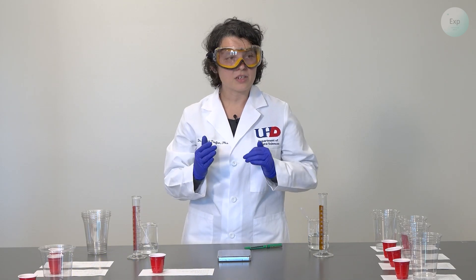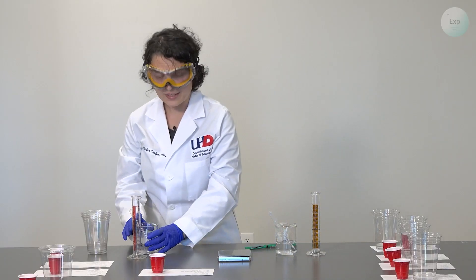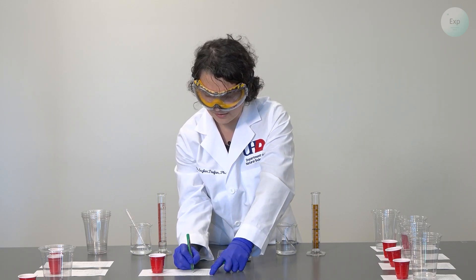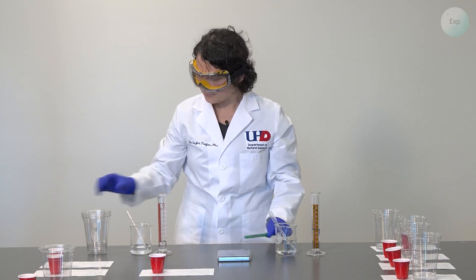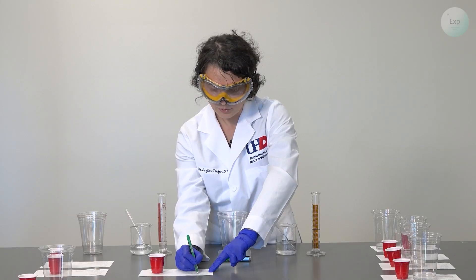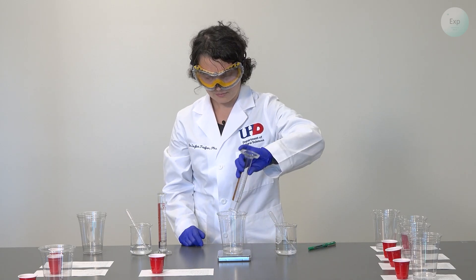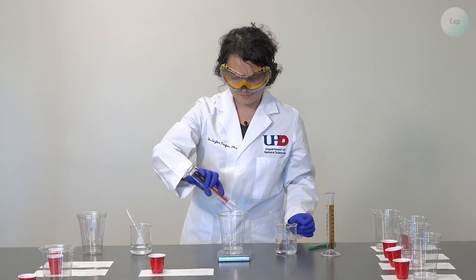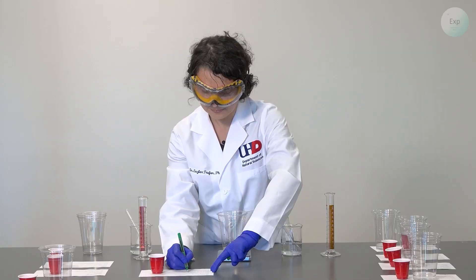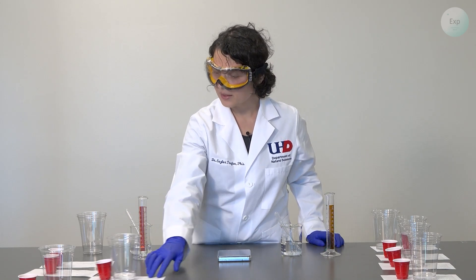For experiment six, we increase the amount of vinegar and decrease the amount of water again. We'll be using 25.0 milliliters of vinegar and 9.9 milliliters of water. We take our sixth cup, place it on the scale, and record the mass of the cup: 14.93 grams. Then we pour our vinegar and water, record the combined weight of 48.41 grams, swirl it together, and place it on the paper.